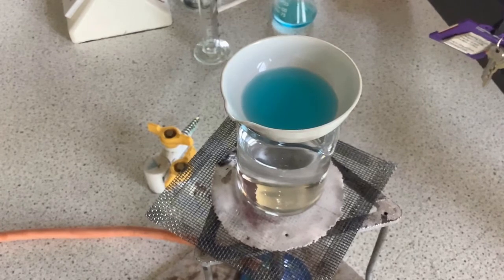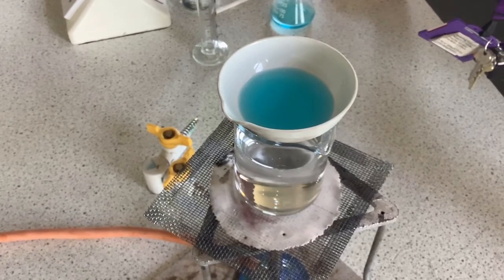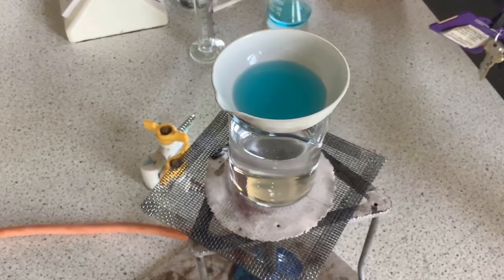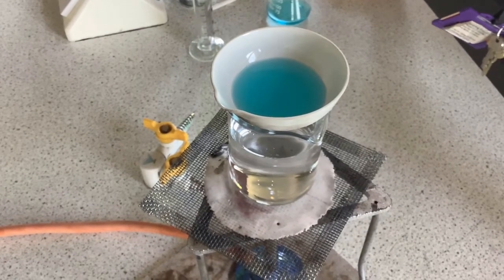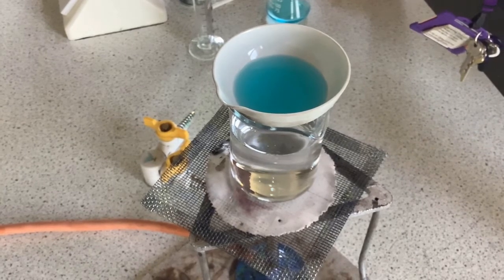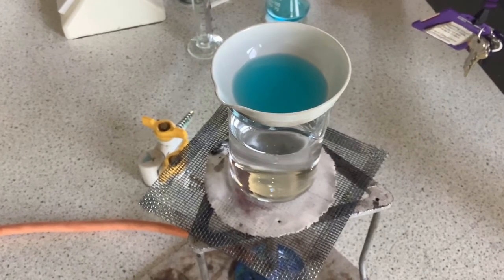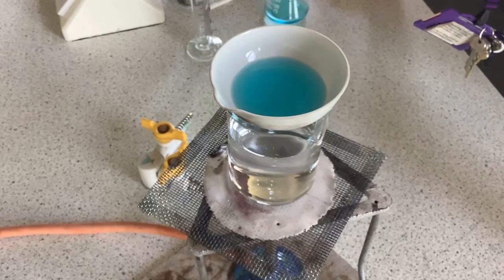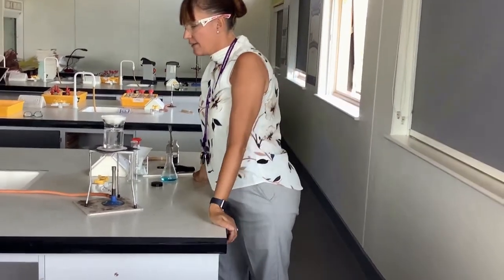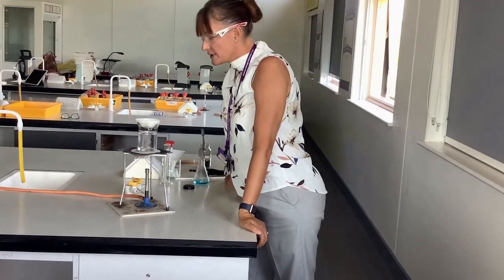Now, one thing to be really careful about in this, and the way that students lose a lot of marks, is they say that they evaporate off all the water, and we don't do that. All we do is we evaporate a little bit of the water to concentrate the solution, and then we leave the solution on the side to crystallise and form copper sulfate crystals.